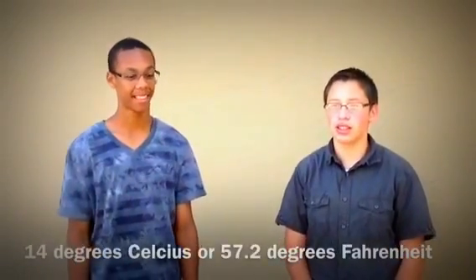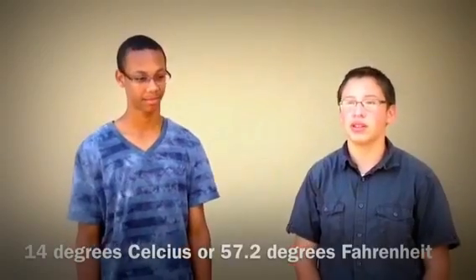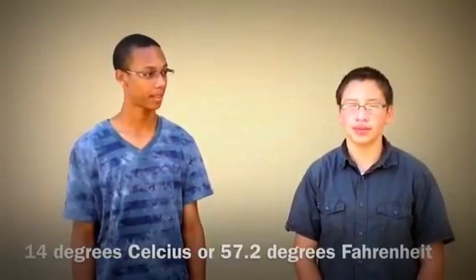Hi, this is Jonathan, and we just came from Grayson Creek to test the water temperature. What's the water temperature, Jonathan? It was 14 degrees Celsius or 57.2 degrees Fahrenheit. Yes. And how'd you do that? I put the thermometer in the water in Grayson Creek. I put it in there about 2 minutes so I could get an accurate result of the temperature.